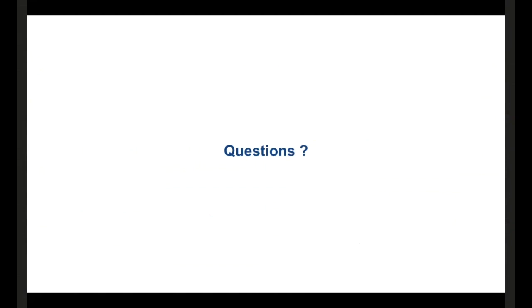No, the session wizards are separate repositories, so they are not part of Scipion. They use the Scipion API for launching the project or setting up the template. The original version of this session wizard, I started working on in Madrid. And then when I moved here to Sweden, I tried to make it a bit more general.